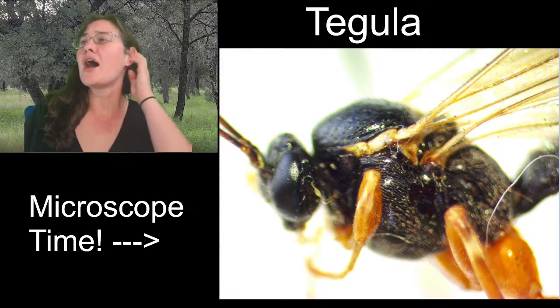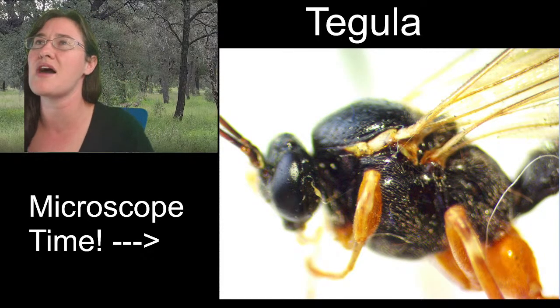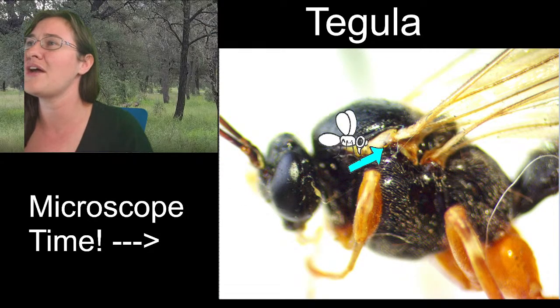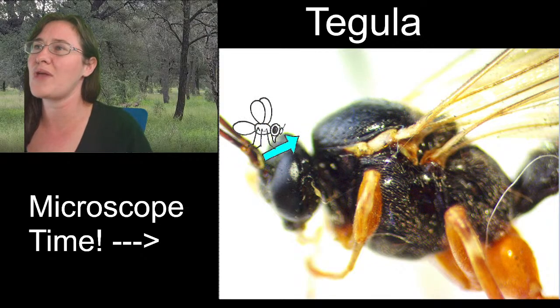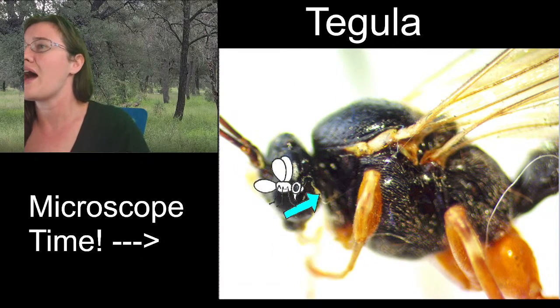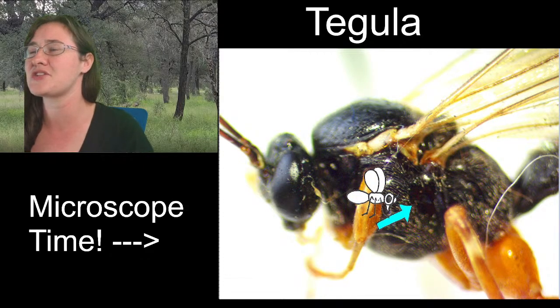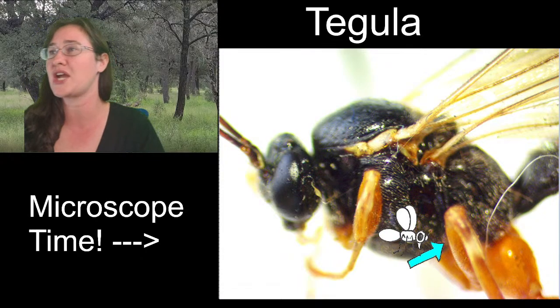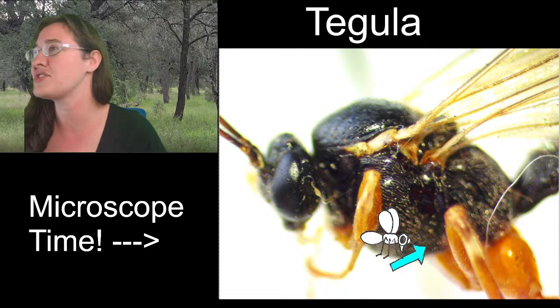So, we can see the tegula, which are the shoulder pads of our wings. They sit right about here, and they are also golden. We have a plate back here on the top of our thoracic region. Most of the thorax is this dark black color. It does have fine light golden or light orange hairs. And then you can see our legs are these beautiful orange colors.